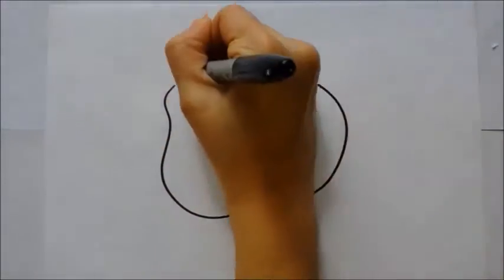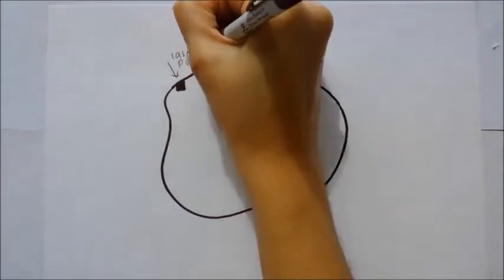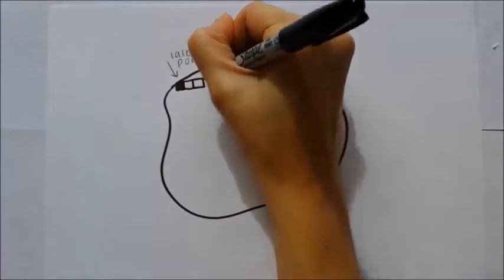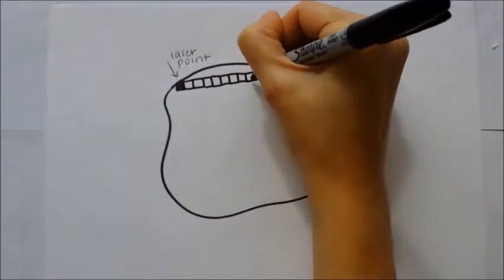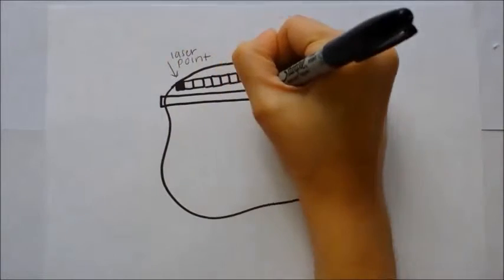There are 2 options to obtain images of all the points within the sample. First, physically move the sample stage as Minsky did, or second, using motorized mirrors, move the laser across the sample to scan the entire area. The second option is much easier to do and is termed Raster Scanning.